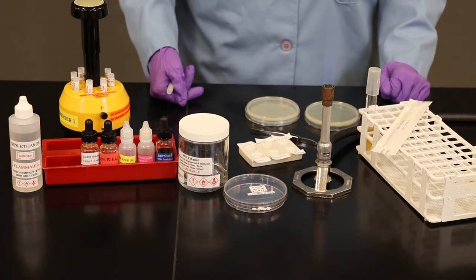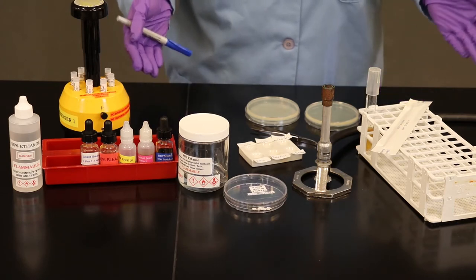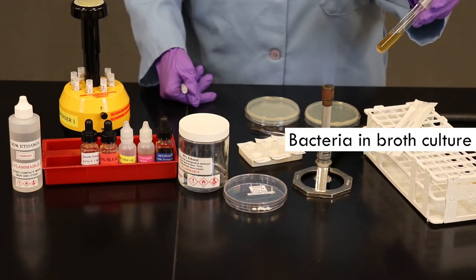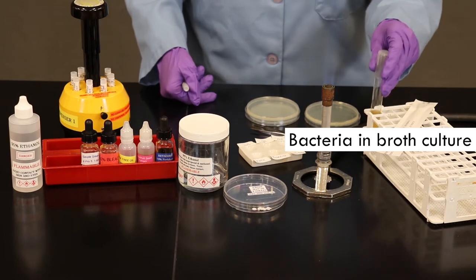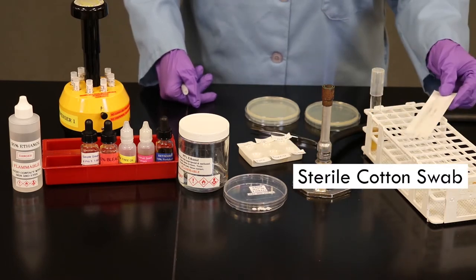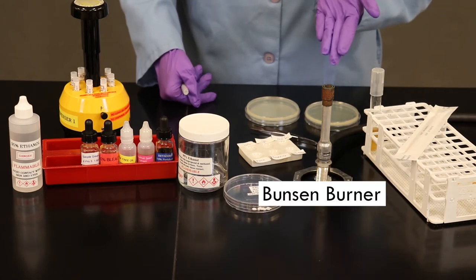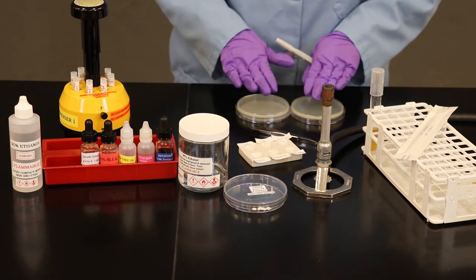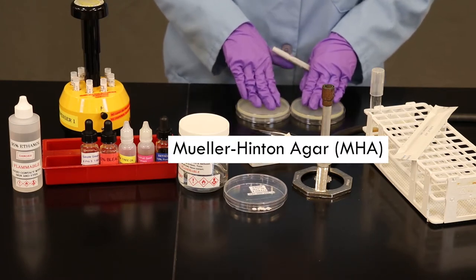For this lab, the following materials are your test tube rack, your bacteria of interest that you want to test in a broth culture, a sterile cotton swab, your ready Bunsen burner. In this case, we're going to be working with two petri plates. These are both what we call Mueller-Hinton Agar.